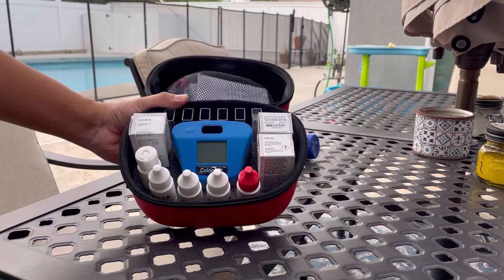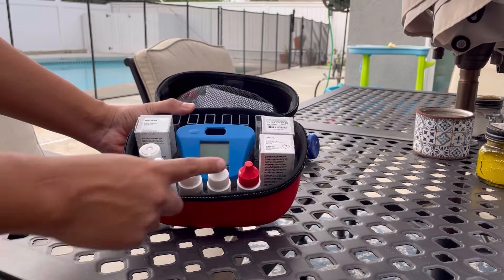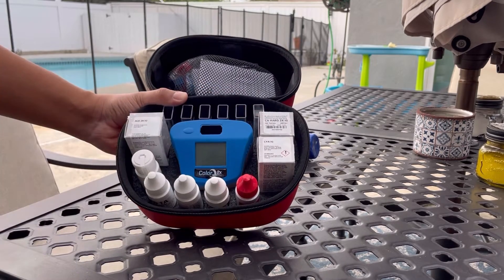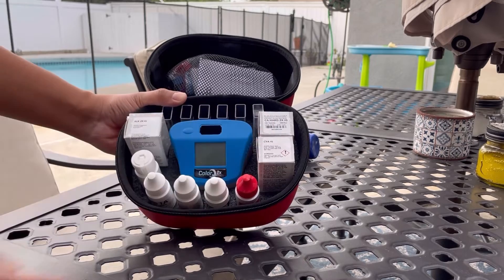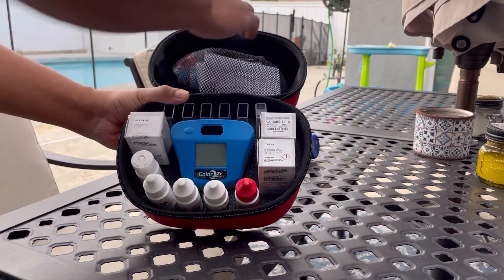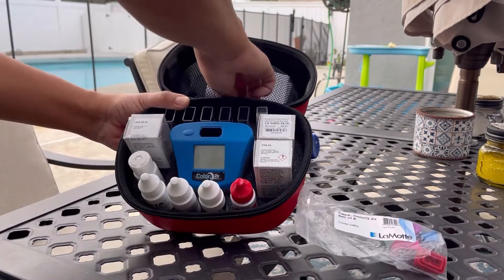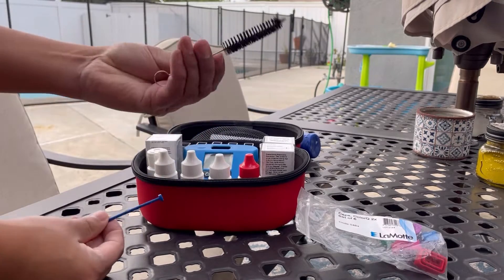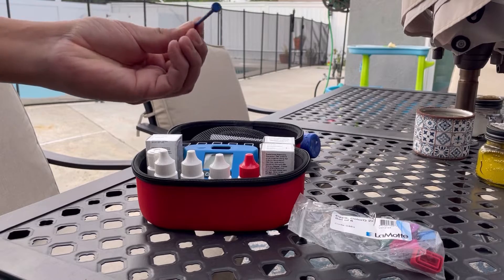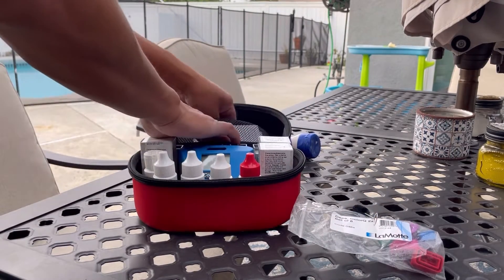You can test for a couple things here. We got liquid to test the chlorine and pH, and then for alkalinity there's tablets. Calcium hardness there's tablets, and our CYA levels is also a tablet. We also have the caps for the tubes, some cleaning tools, and the tablet crusher. We're going to be using that when we test our water today.